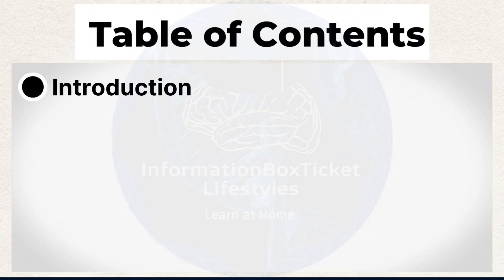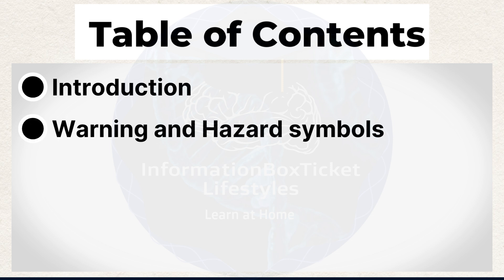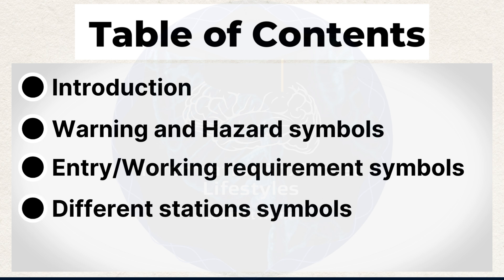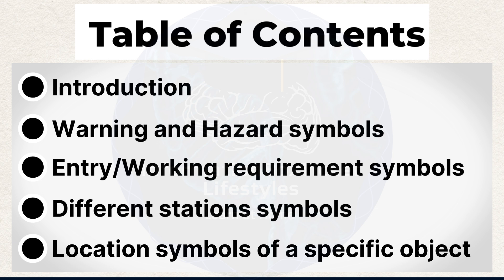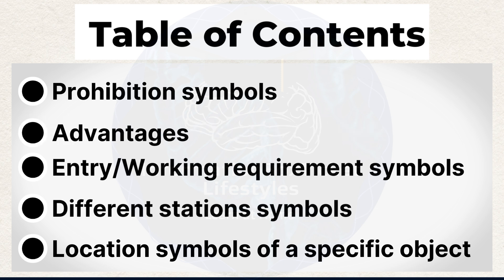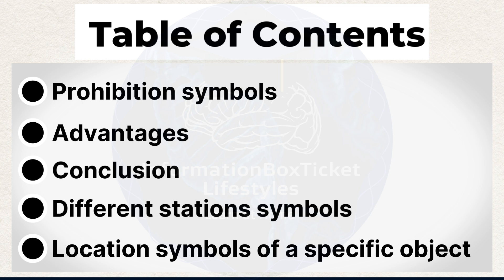Introduction to laboratory safety signs. A: Warning and hazard symbols in the lab. B: Entry/working requirement symbols in the lab. C: Different station symbols in the lab. D: Location symbols of a specific object in the lab. E: Prohibition symbols in the lab. Advantages of laboratory safety symbols. Conclusion.